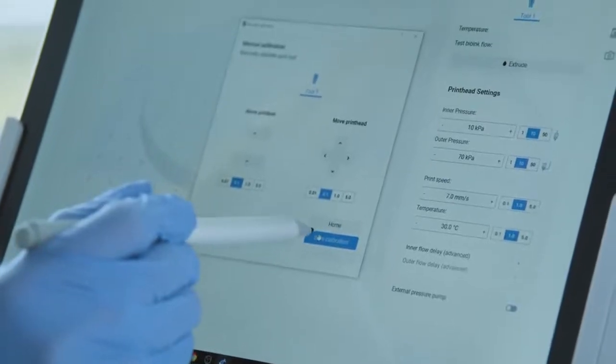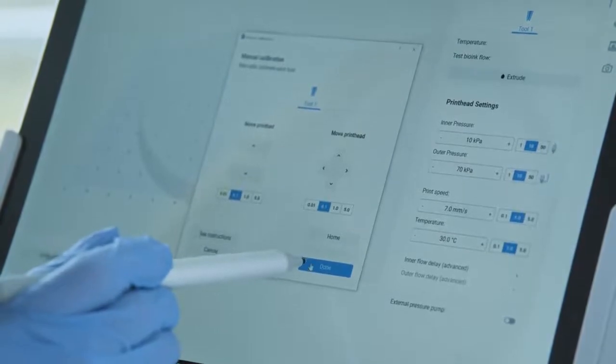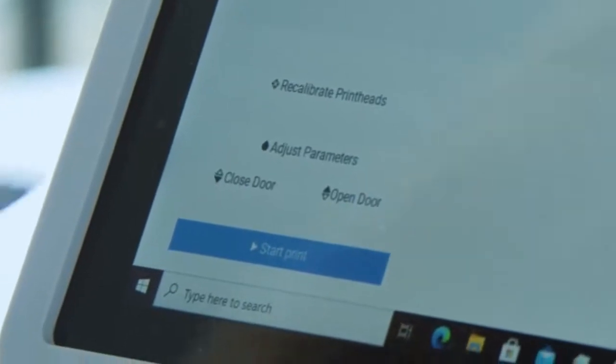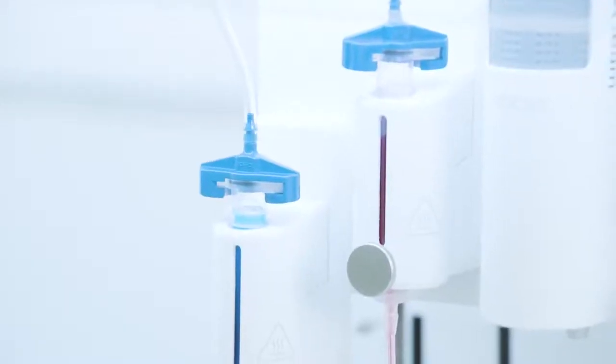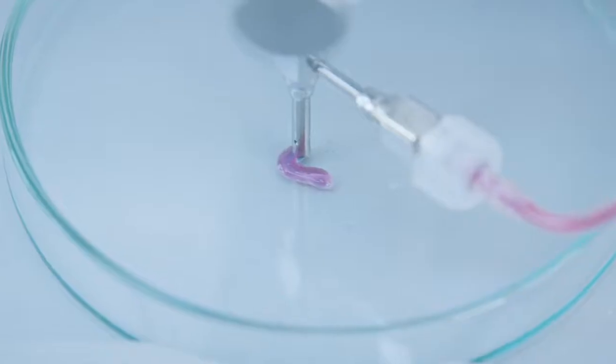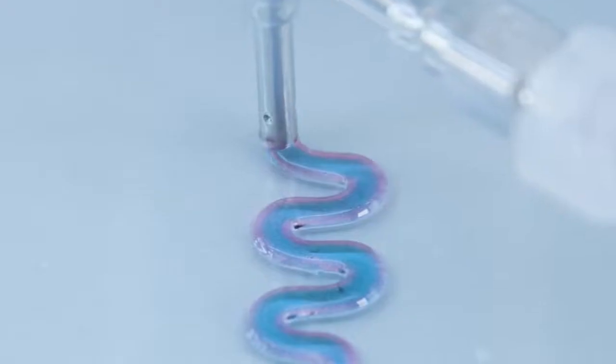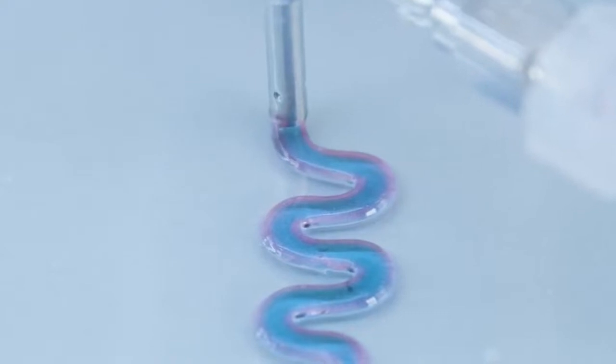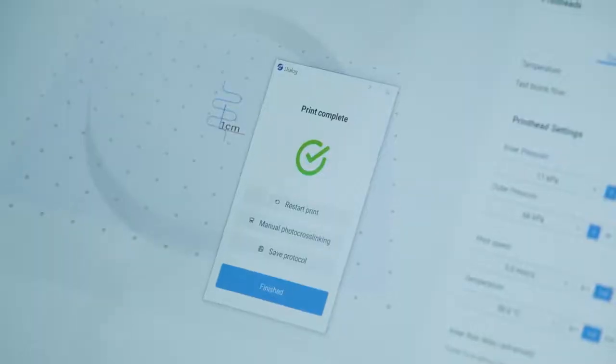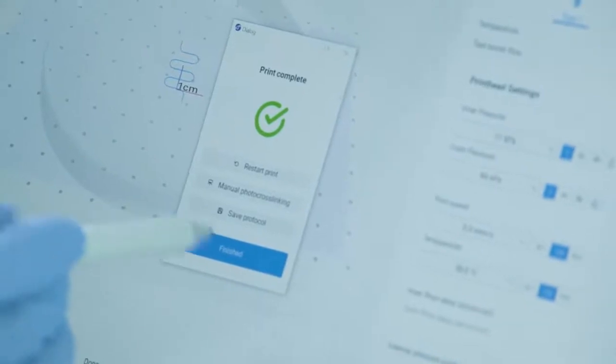Okay, this is perfect. Save the calibration and done. The setting is ready to print and now start print. As you can see clearly, the inner layer in blue and the outer layer is in red. After printing you can save your protocol, go through cross-linking process based on your bioinks, or restart printing.